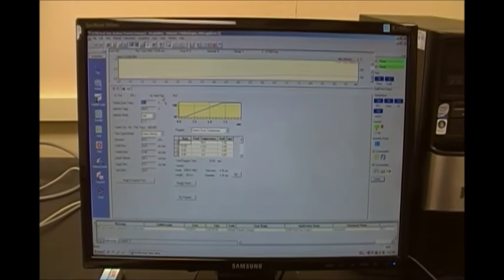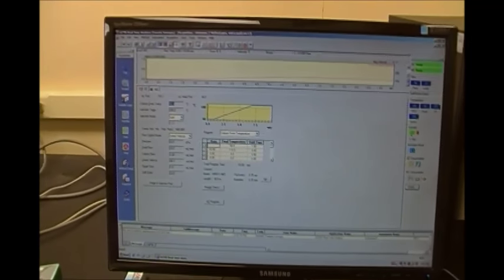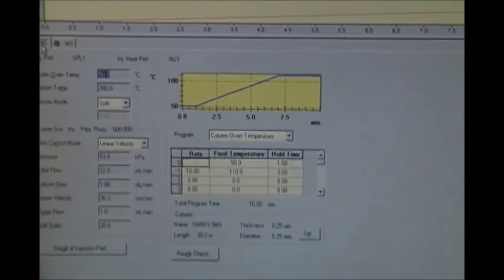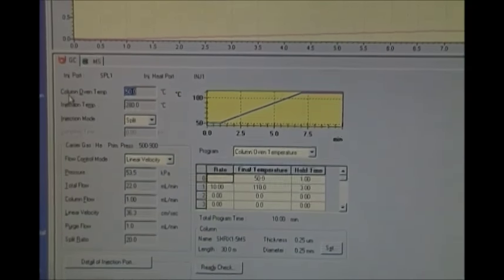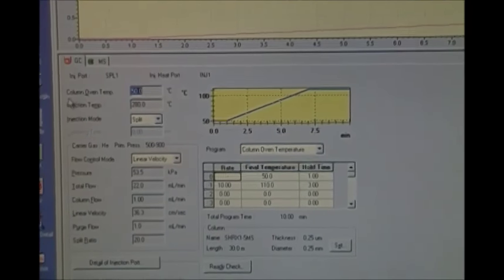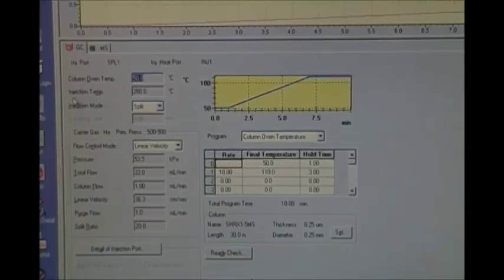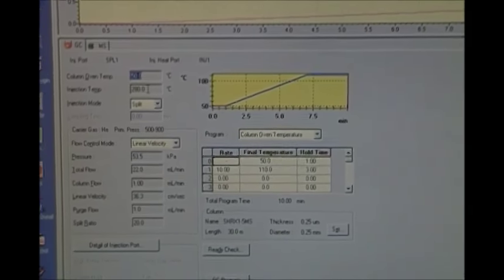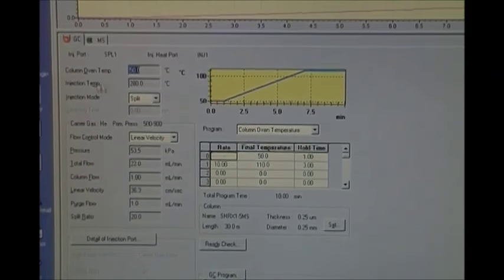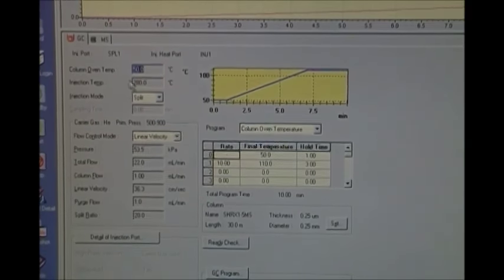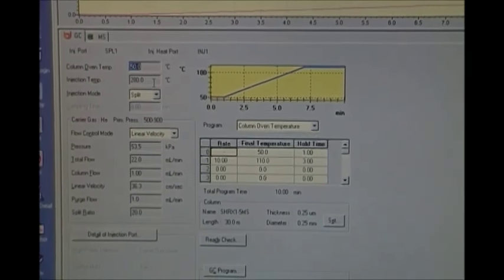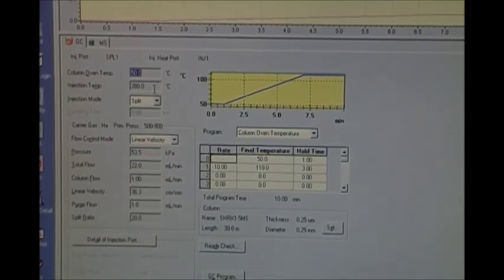So we're here at our method detail. This is our method detail for GC. A couple of important things: our oven temperature, which is also the temperature of our column, is set to 50 degrees Celsius. And then our injection temperature, which is 280 Celsius. Now our injection temp is 280, which is also the same temperature as our GCs in the lab.